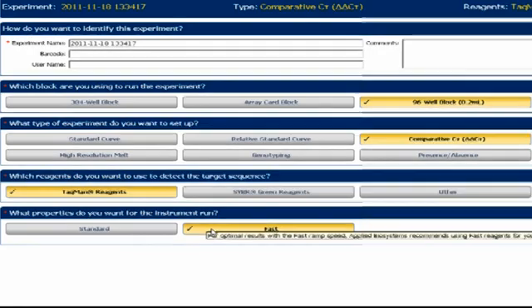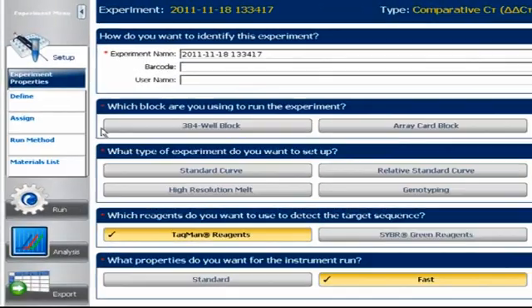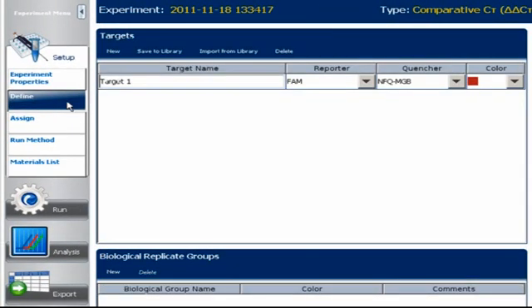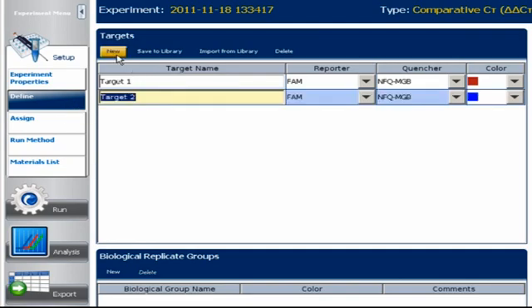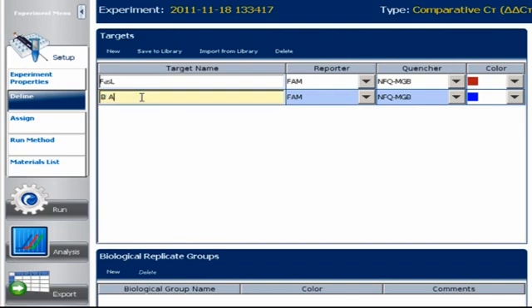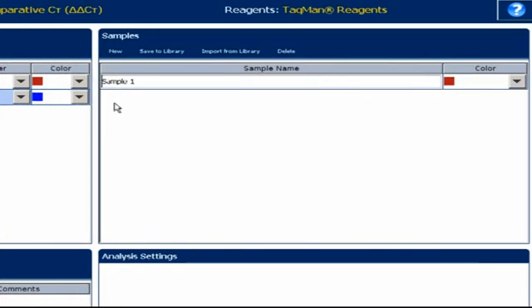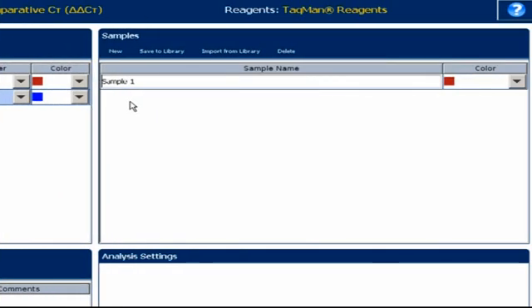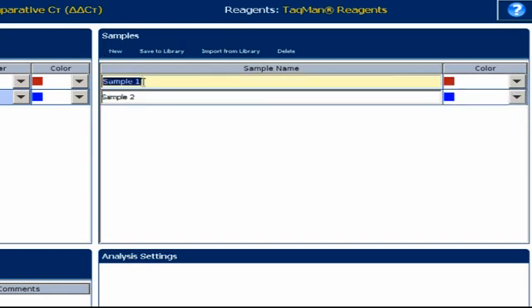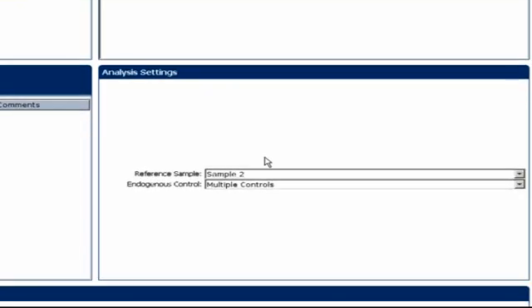We'll say we're doing TaqMan chemistry in fast mode. Go to the left under Experiment menu and select Define. Manually enter the names of the targets and samples by first clicking on New until you have the correct number of blank spaces, and then type the names into each space. Be sure that the reporter and quencher are correct. The sample section works exactly the same. We'll just use a couple of names for this demonstration: Untreated and Treated.